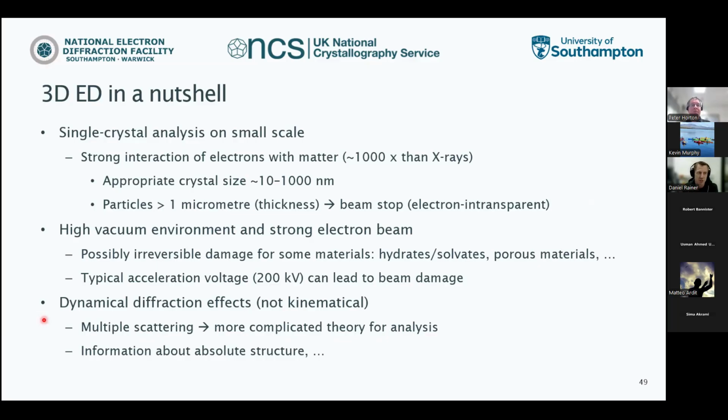And this needs to be addressed, and this makes the maths quite a bit more complicated than is the case in XRD. Many of the other things are literally the same, but for this part, one should take this into account for a proper analysis.